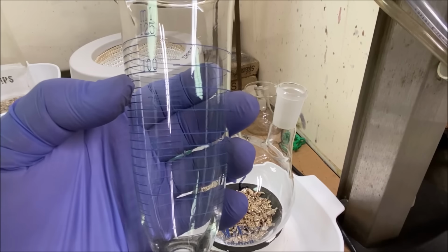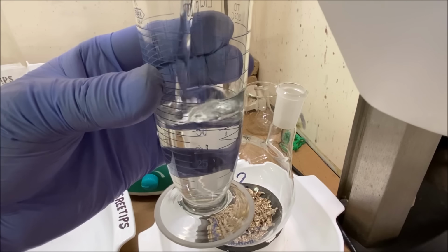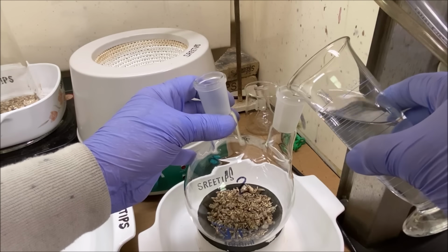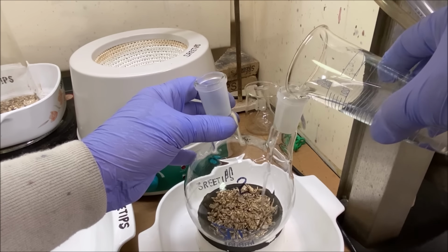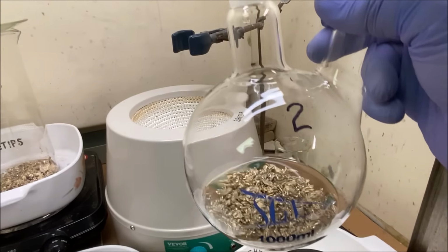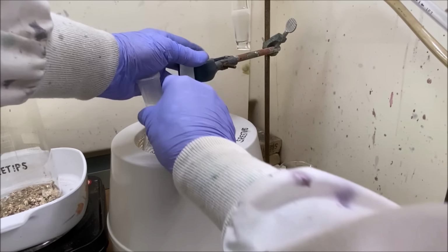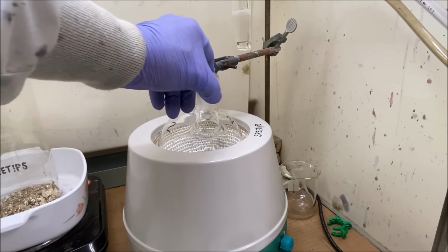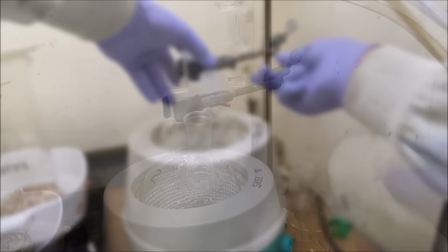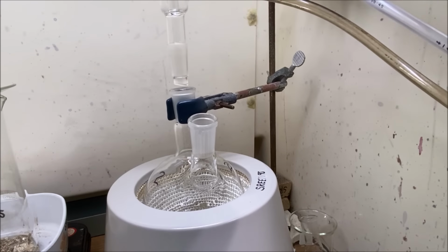Now I'll measure out 100 milliliters of distilled water. I'm not going to be real super accurate with this, but just kind of measure things carefully as we go. We'll add that into our reaction vessel down here. Got our reaction vessel with our charge of gold in it, so now we'll set this back into the heating system here that we have set up. Wipe off this little bit of excess sulfuric here. Line this with our flask.